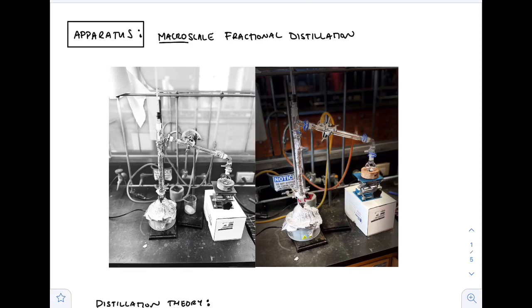All right, so this video or this lab is all about distillation, right? So we're making some moonshine. We combined our sugar with our yeast and some pasteur salts, and we let that hang out kind of warm for like a week, and then in theory we should make some ethanol in there. And so now we want to distill that ethanol off and isolate it in its somewhat pure form, just to see what we can get.